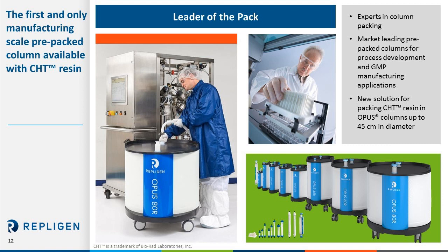And so we would look at things like chromatography test skid setup, making sure that there's no air that's been put on the column. And so with proper troubleshooting, most non-conforming columns can be remedied through things like that.